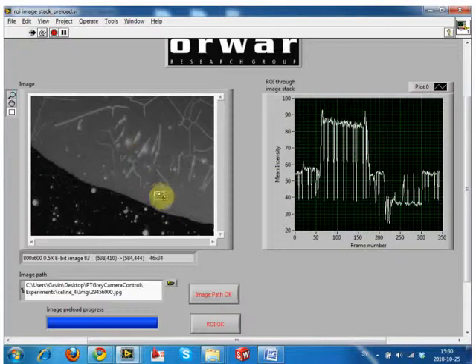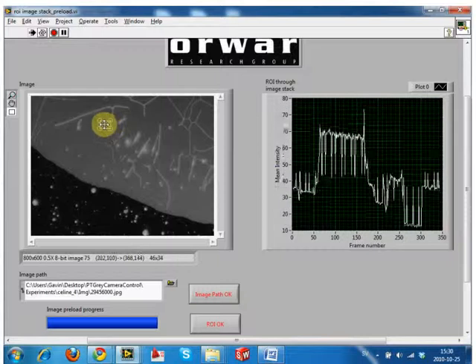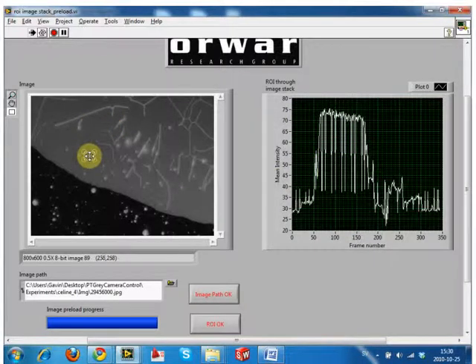I don't know, it's kind of an arbitrary data set to do this on, but essentially all you can see is that there is a different way of doing it. We can run it in real time if that's what you want. And for some things like this, if you're looking for particular events somewhere in the file set, this is a more efficient way of doing it than drawing a box and then doing all of the images, because a lot of times you don't know if you're in the right location or not. This essentially gives you a much better idea of what you're doing.